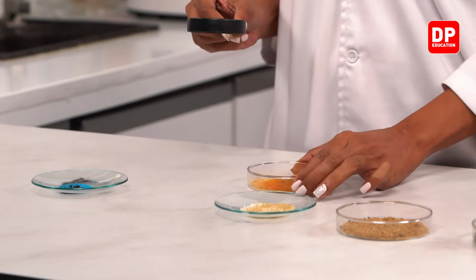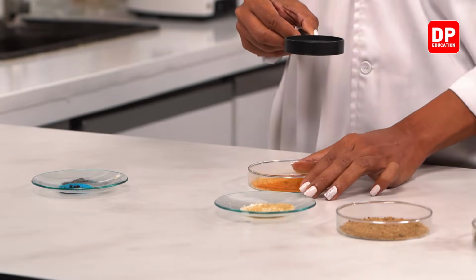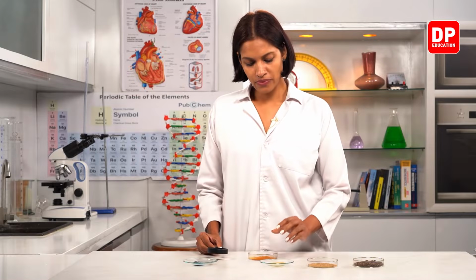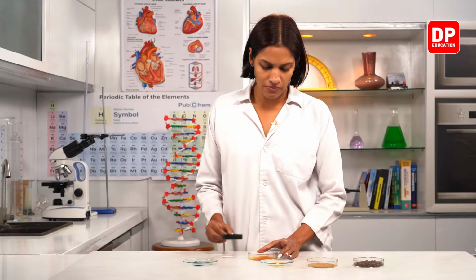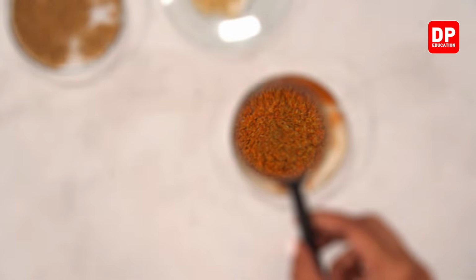Right, children? Look at this. This is a spice mixture. Different types of spices are mixed here. Can you all see? Now when you look at this like this, you cannot see everything very clearly. You can see it's just a mixture. But when you use the hand lens, you can see very clearly. Can you all see orange color particles, children?